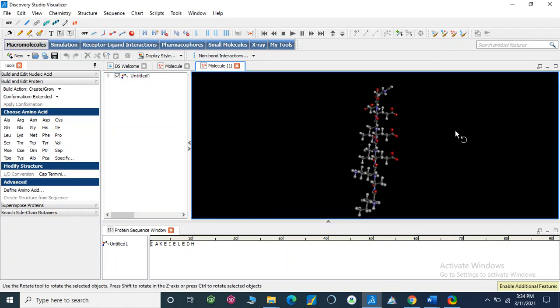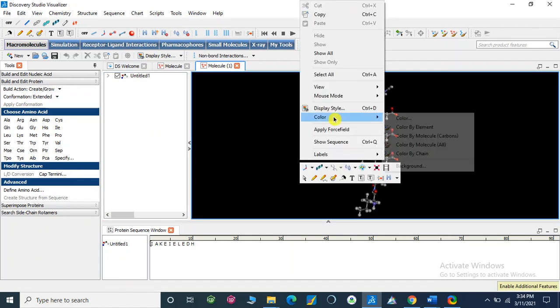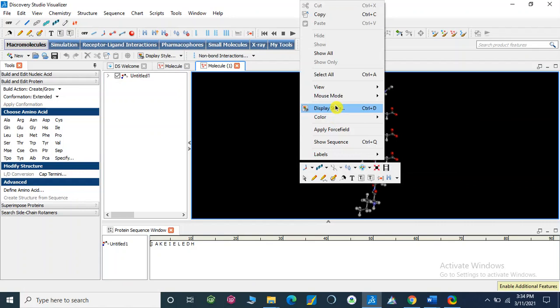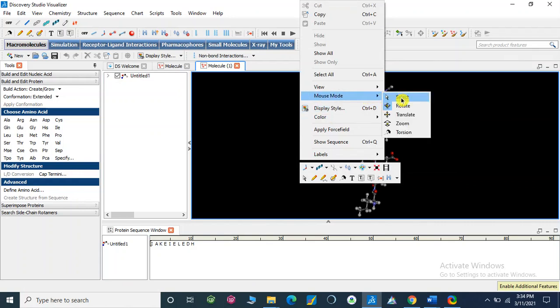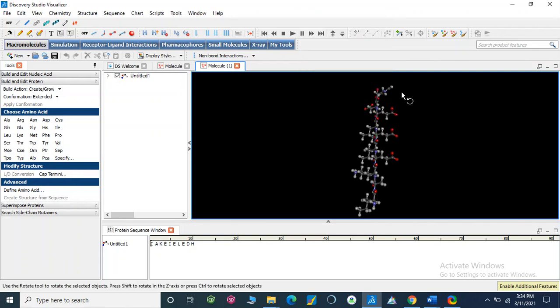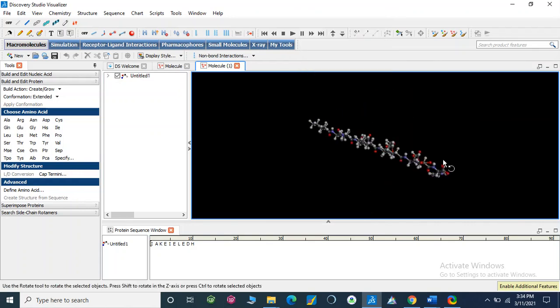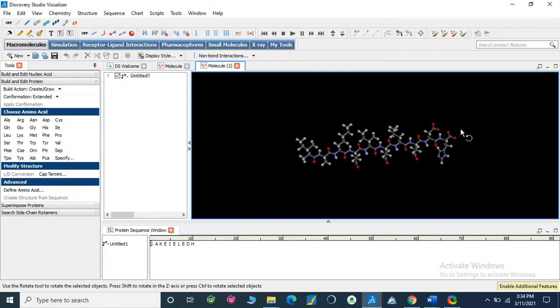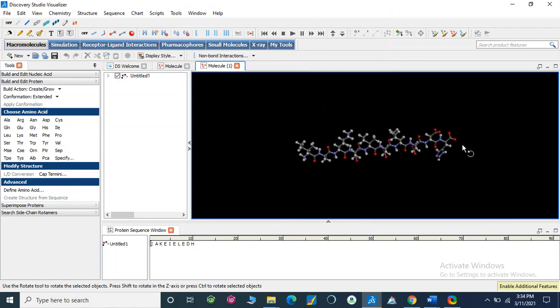But this is not a cyclopeptide, so it is a straight chain sequence. If you look at here, okay.